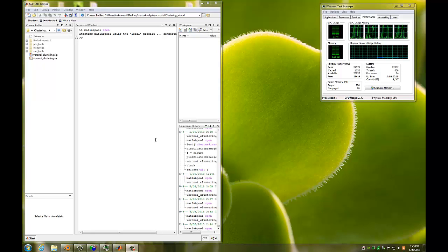Hi, my name is Peter Felfer, and today I'm showing you how to do clustering analysis using the Voronoi clustering. It's part of my OpenVA software packages that I'm starting to distribute now. And what it actually is, is a cluster analysis based on concentration fields.